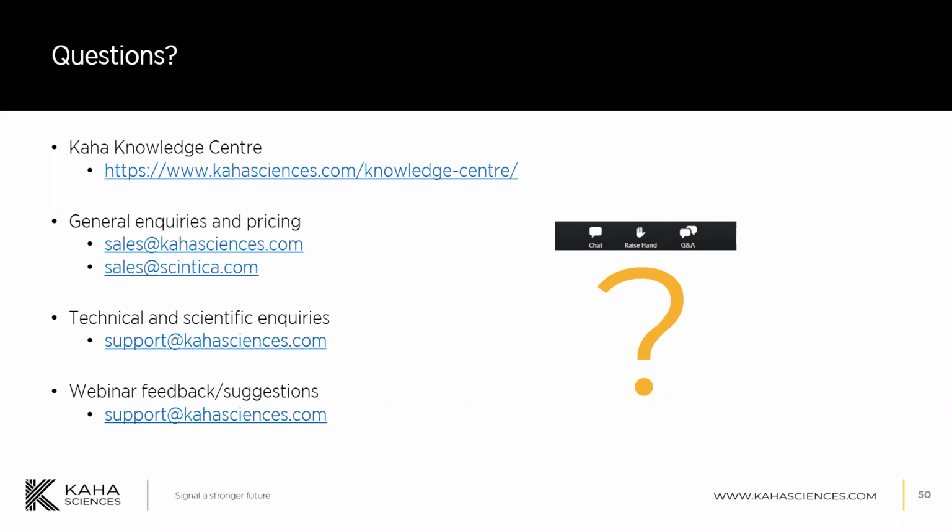Attendee asks about using the carbon-based electrodes for measuring tissue oxygen in different animals. Am I correct in saying that right now it's just for rats? Our telemeters certainly are the same in theory, and a benchtop potentiostat can be used in other animals.